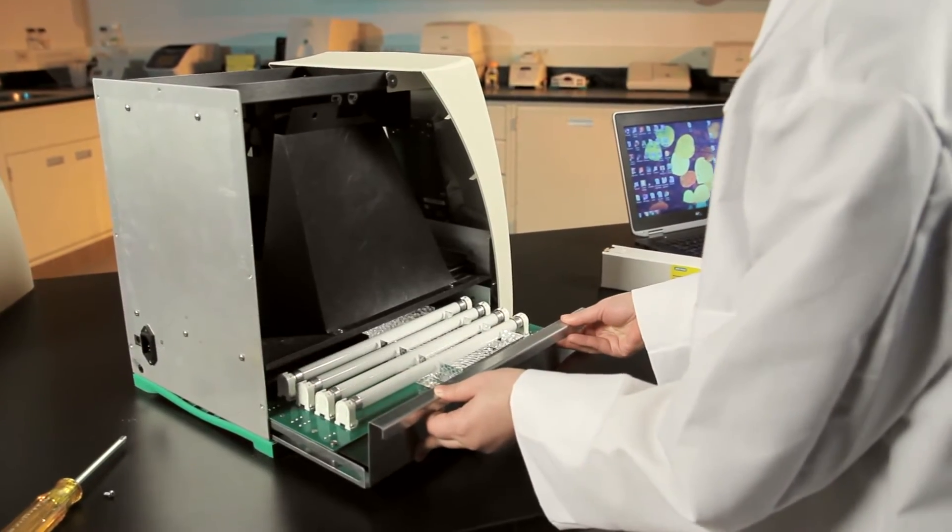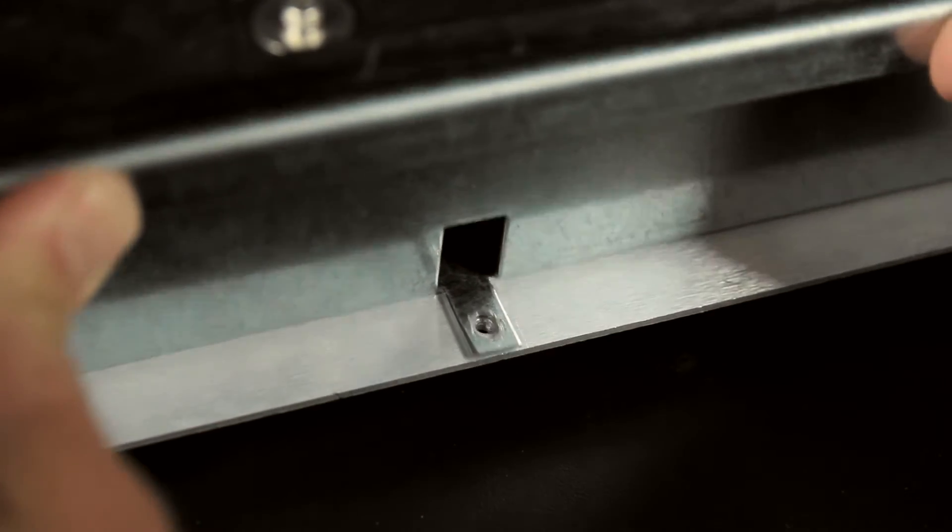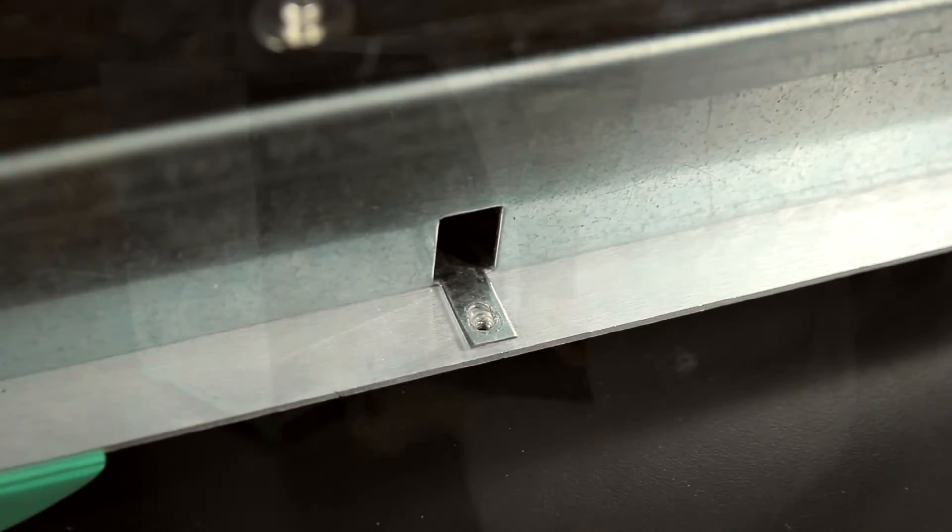Once you've replaced all four bulbs, slide the lamp drawer back in and replace the securing screw. You may need to push the side of the drawer down next to the screw tab so that the holes align.